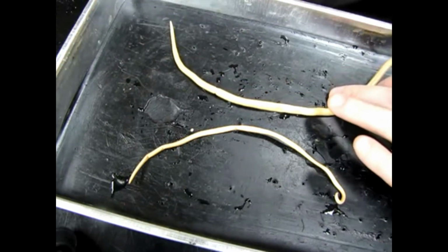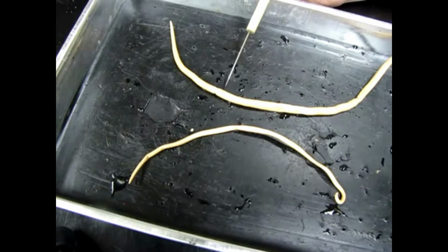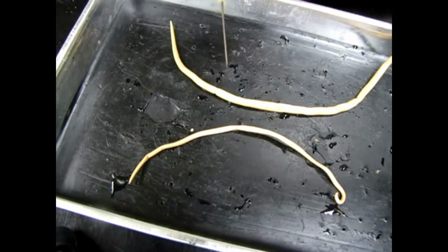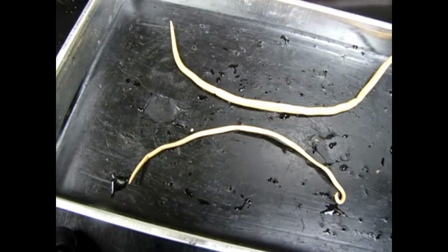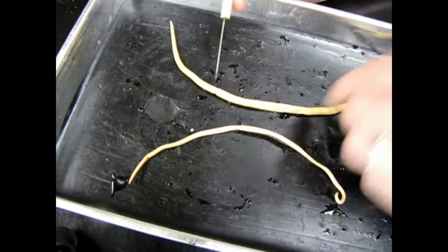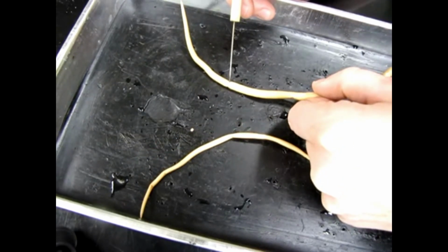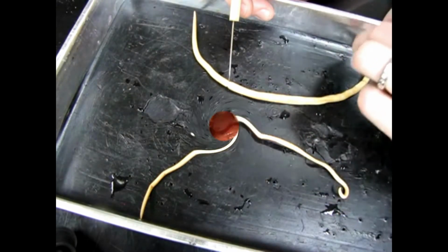So now that we've found the anterior end, we know that if we travel about a third of the way down the length of the body, we should be able to find what's called the genital pore, and this is the hole essentially that enters into the vagina, and that's where sperm is transferred into from the male. So looking down here, I can see it. I don't know if you can see it on the video. It's a small little pinprick sized hole. It's located right here. So just to give you a sense where that is.